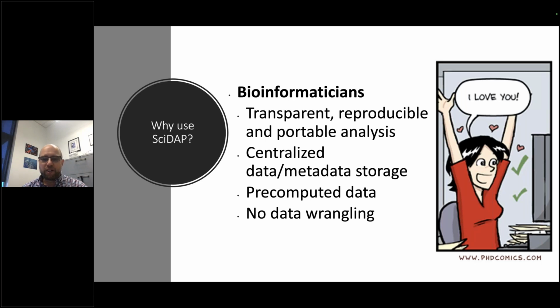The advantage for bioinformaticians is that the pipelines we use are all written in so-called common workflow language. They are transparent, reproducible, and portable. In fact, almost all our pipelines are available on GitHub, and they can be run outside SciDAP, but of course, there will not be our nice user interface. Another advantage is that all data and metadata are stored together, and this allows everybody to access the same data, and bioinformaticians and biologists will be working from the same initial preprocessed data set. And nobody needs to run around with hard drives, look for data on somebody else's laptop, and so on.